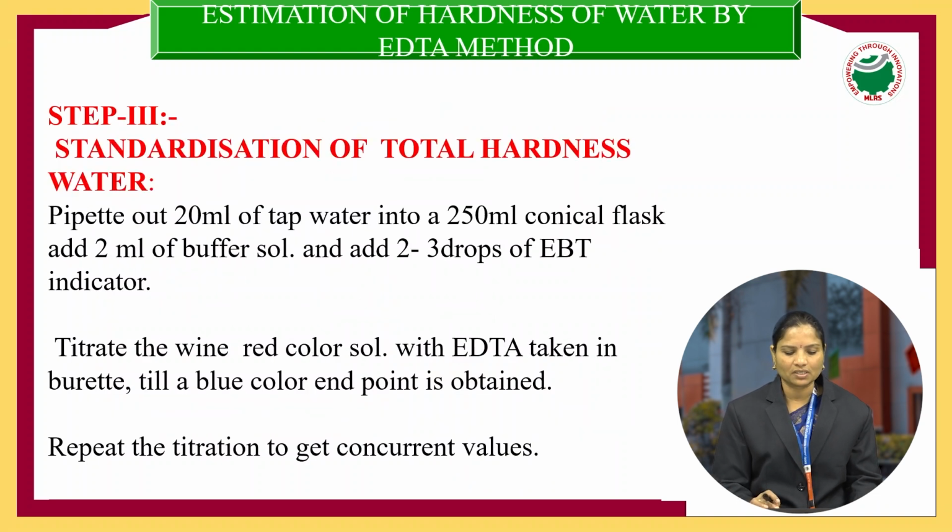Then go to step 3, standardization of total hardness of water. In this, we directly take our sample of water, that is hard water or tap water or any source of water, and we take only 20 ml of it.